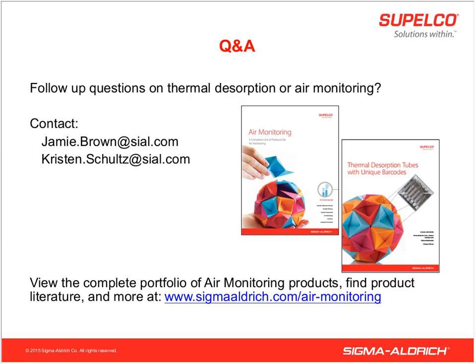Here's a question from Dan. Please address any shelf life considerations for the sample media. The media itself, the adsorbents, really have no shelf life. Once they're packed in the tube, we condition that tube so we drive off anything that was collected on the adsorbent during storage. A completed air monitoring packed tube usually ships conditioned. We do also sell them unconditioned, but once they're sealed up in their storage container, they typically have low backgrounds even after a year in storage.